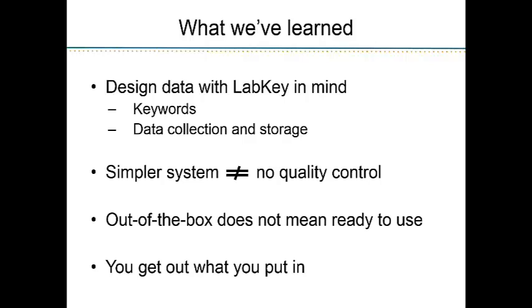Time saver for sure. A simpler system doesn't necessarily mean that there isn't any quality control involved. Because we can maybe import the data directly from the machine doesn't mean that we don't want to actually look at the data before we push it into the study and say, okay, these are our finalized numbers. Out of the box doesn't necessarily mean ready to use.